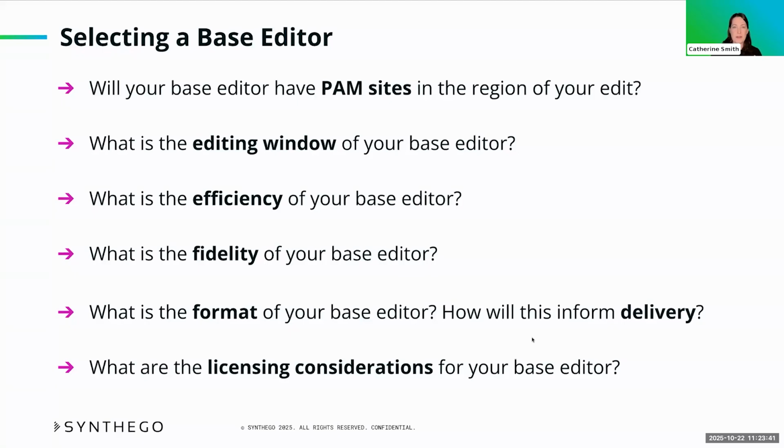What format is your base editor available in? Will you be delivering your base editor as a protein, as an mRNA, as a plasmid? These considerations tend to really inform your delivery strategy. And then finally, if you're interested in therapeutic development with a base editor, you may want to consider the licensing of that base editor and how that might impact your ultimate therapeutic development plans.